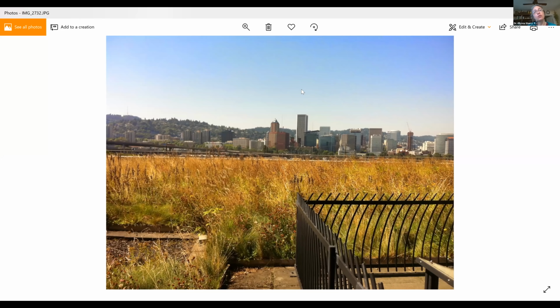We have a graduate student who was able to determine that there is a ratio of CO2 and water use by plants relative to the rate of ozone deposition. So you can predict ozone deposition onto a green roof surface if you know something about stomatal conductance and CO2 uptake. We're going to use the CI-340 to validate and verify some of the measurements we've been taking on ozone deposition and some of the ozone deposition modeling we've been using.